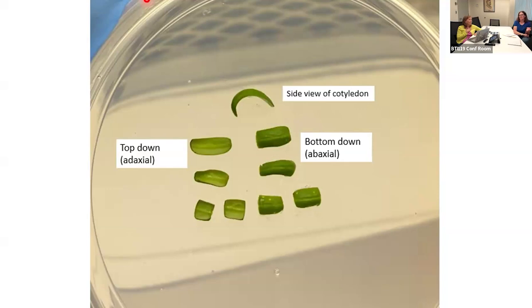And I mean, that's the great thing. You can just use them over and over and over. Yeah, and occasionally we might have to replace lids, those get brittle over time with the light in the culture room. Again, there are other people using other containers, but please be aware that if you do use a different container, you might get different results than what we're getting. So you might have to change some things. And again, it's a preference. For us, the magenta boxes are a preference for the reasons I mentioned. We can reuse them. We're not discarding them. Because like we said, we already put so much in with this Petri plate. Yeah.